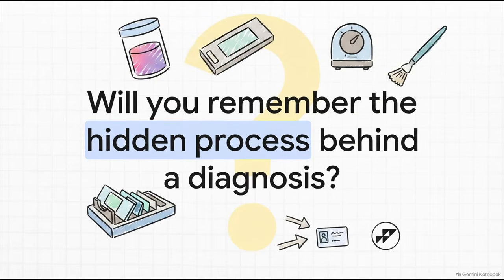It's amazing. It is absolutely incredible to consider the invisible, meticulous labor that goes into every single tissue slide. But before a finished slide even reaches a pathologist, it has to undergo a few final, crucial steps. We're talking slide ringing with sealants like DPX or Canada Balsam to prevent drying out and fungal growth. And of course, meticulous labeling following strict CAP and Joint Commission protocols, which requires 2 unique identifiers like the patient's name and their accession number.